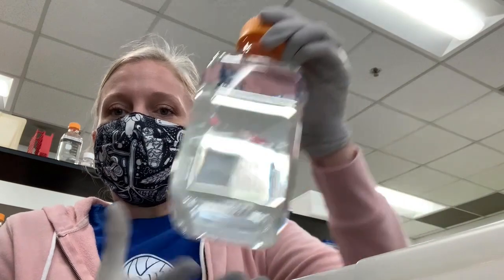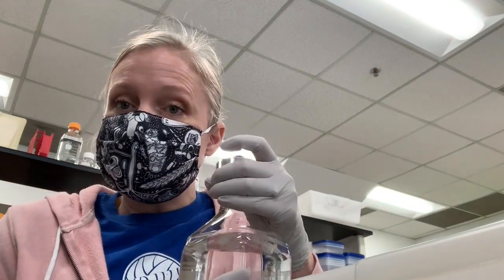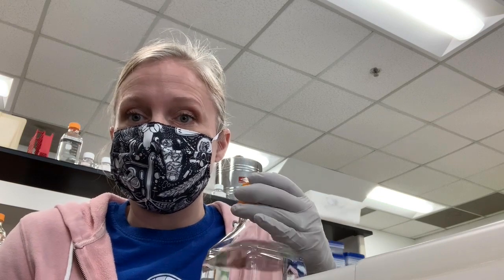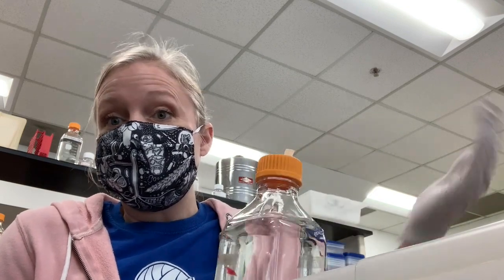You want to also get all of your solutions ready for autoclaving. I will cap all of these solutions entirely until I get up to the autoclave, and then we'll vent them. You never want to autoclave something that's sealed all the way because the air in the bottle will expand as it's heated up and can explode the bottle. So you always want to make sure you give it about a half turn and leave the lid loose. But I always tighten the lids until I get to the autoclave and then check them all when I get there.